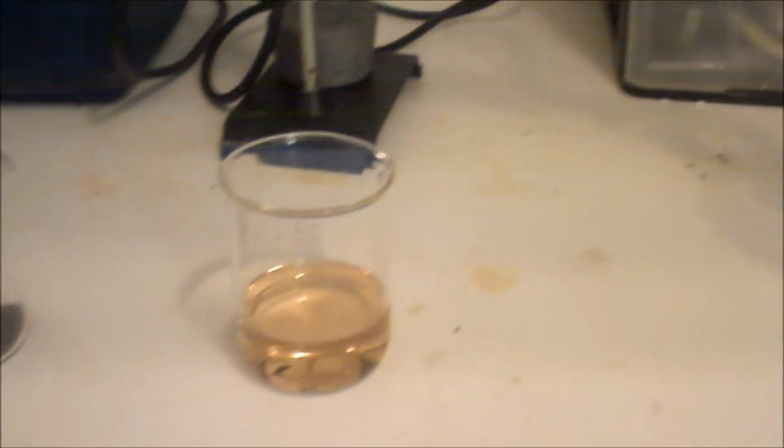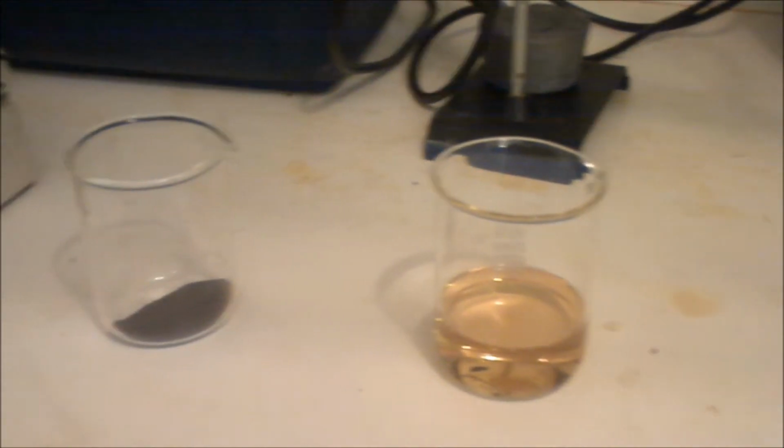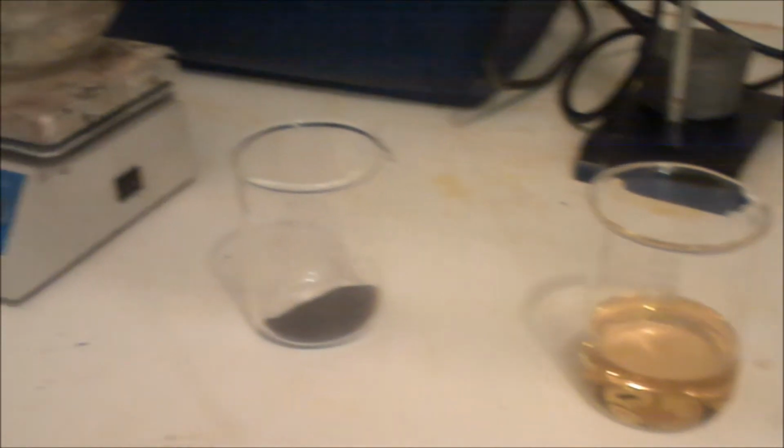I got a funnel on the side. I'll put a stopper in that. I've got a column going up to a pressure equalizing funnel, and it goes down an ice cold condenser into a collection flask, which I have right there. Then in that beaker right there, I have some sulfuric acid, and in the beaker to the left of it, pardon me, we have 131 grams of potassium permanganate.